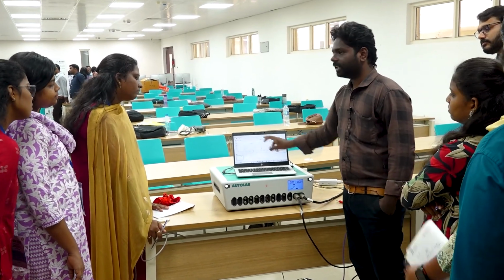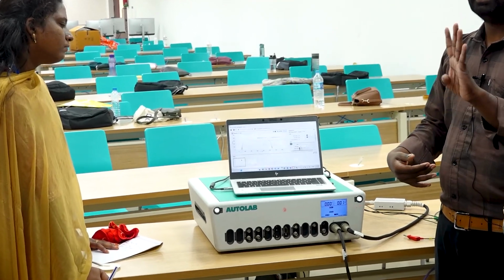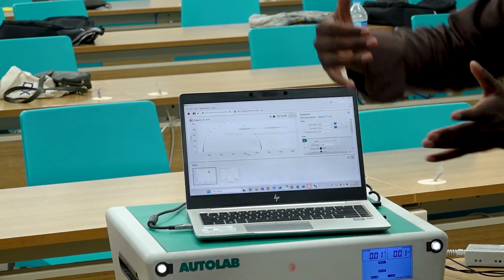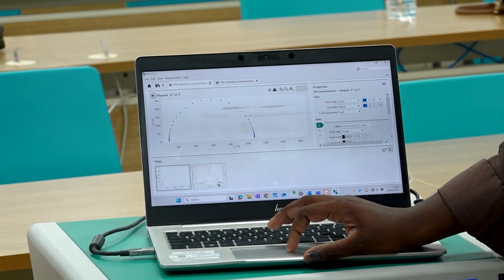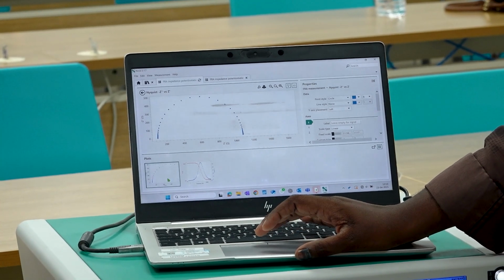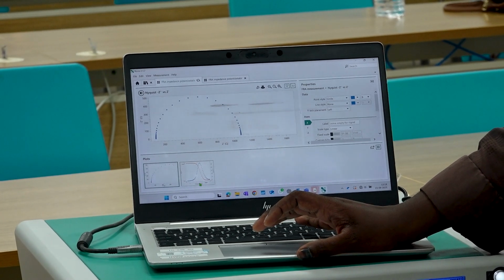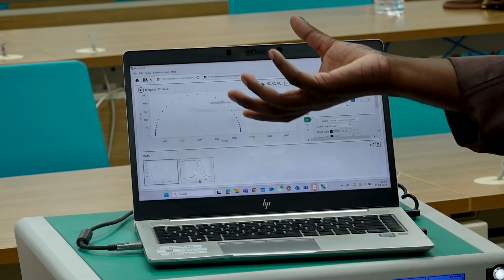We are getting the data. Whatever we have discussed, those 4 parameters, all the parameters will be in this graph only. So we have to interpret, analyze, and extract the data. We have two graphs here. The first one is the Nyquist plot, and the second graph is the Bode plot. Generally, Nyquist is sufficient for most of the analysis. For very few applications only Bode is required.